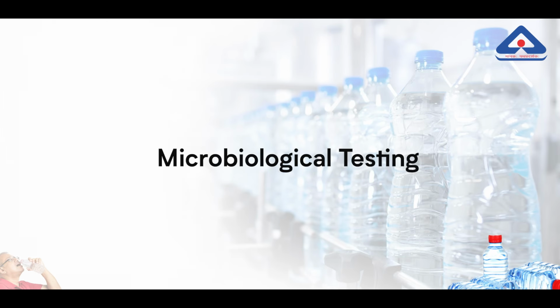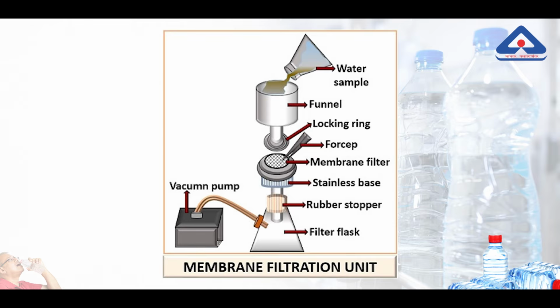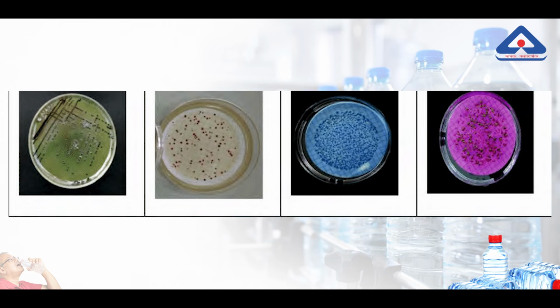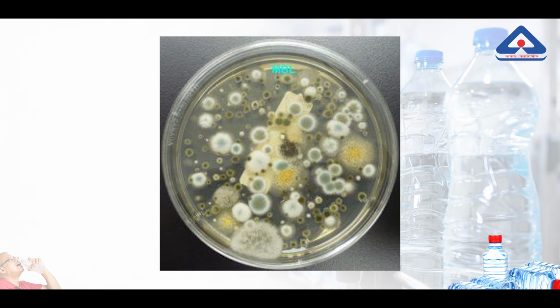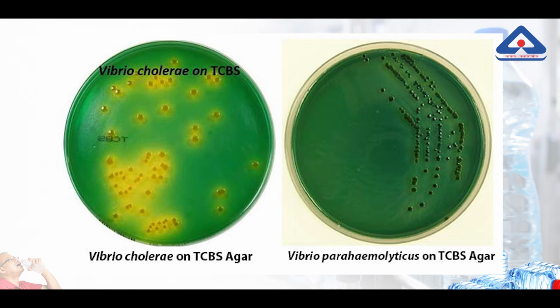Microbiology. 1. Membrane filtration for pathogens. The membrane filtration technique is used to detect microorganisms like E. coli, coliform, fecal streptococci, Staphylococcus aureus, Pseudomonas aeruginosa, yeast and mold, Salmonella, Shigella, Vibrio cholerae, and Vibrio parahaemolyticus.